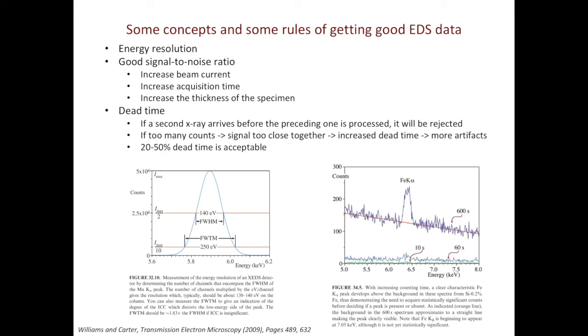However, when you have too good signal-to-noise ratio, it's not a good thing. You will run into a problem of dead time. It takes time for computer to process X-ray data. If the second X-ray hits the detector before the computer is able to finish processing the first signal, the second signal will be discarded. Therefore, if we have too many counts, then the signals will be too close together and this will increase the dead time. Increased dead time leads to more artifacts. So what we want is a good balance of signal-to-noise ratio and dead time. Usually, 20 to 50% dead time is acceptable.